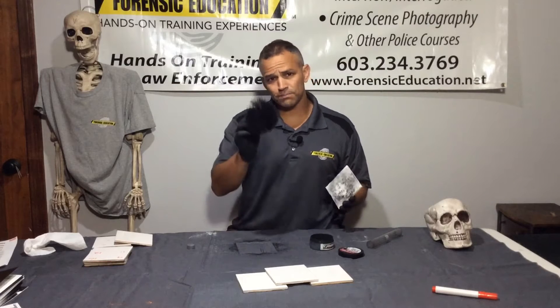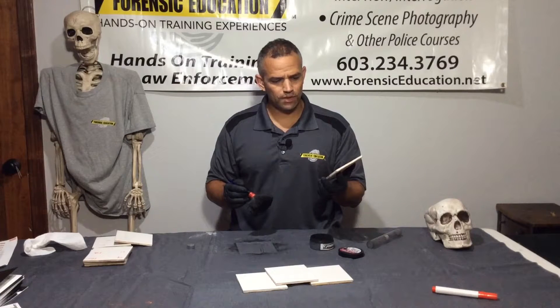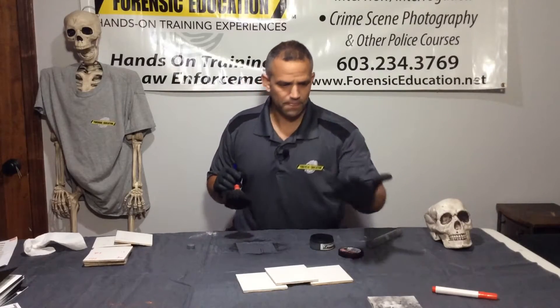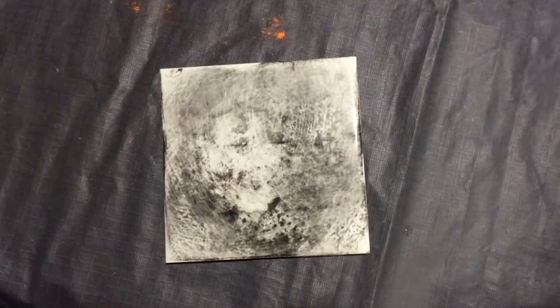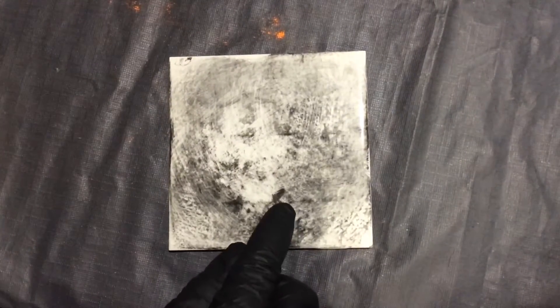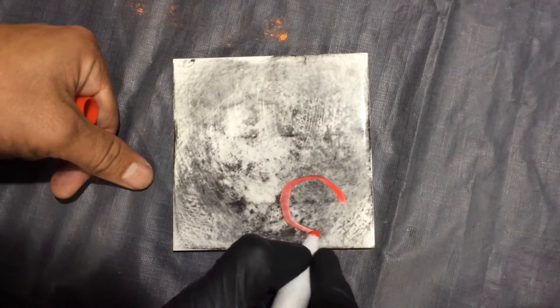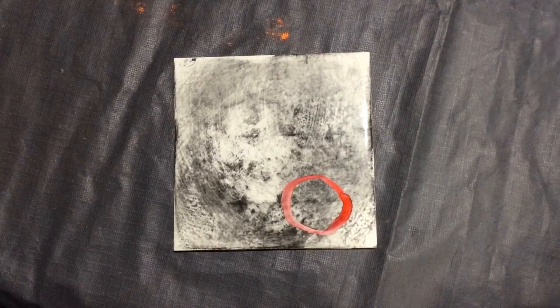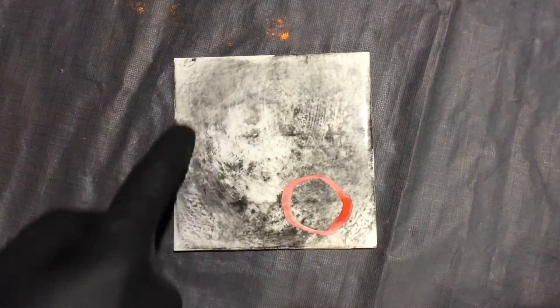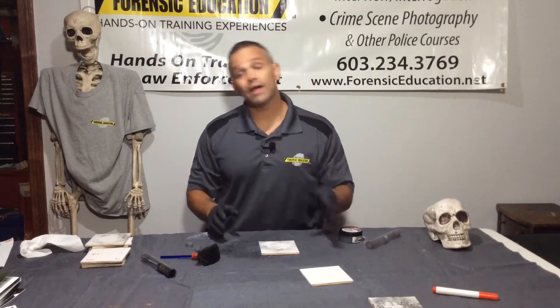So that's the first mistake — using too much powder. You only need the tiniest bit of powder. Here's our print; it is really overdeveloped, as you can see — so much background. Here's my print, you can actually see the print right here. You can actually see the ridge detail in there, but this is really overdeveloped. If you tried lifting that, you're going to get all of this background. You don't need that nonsense.